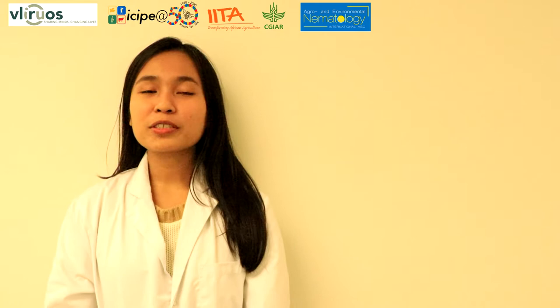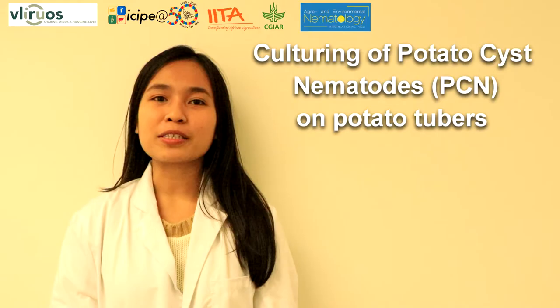Hello everyone. I am Sheila and today I am going to demonstrate how to do in vitro culturing of potato cyst nematodes on potato tubers.